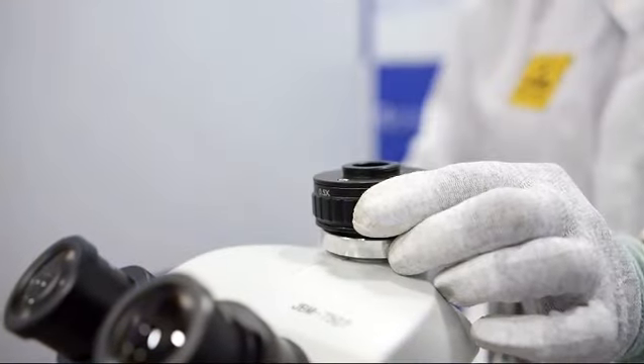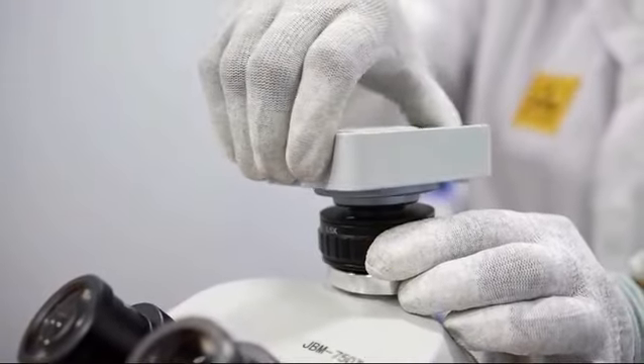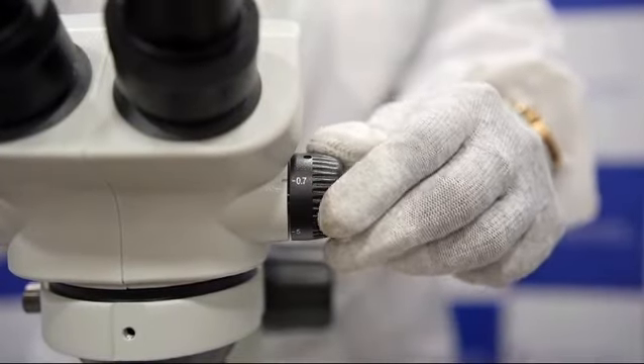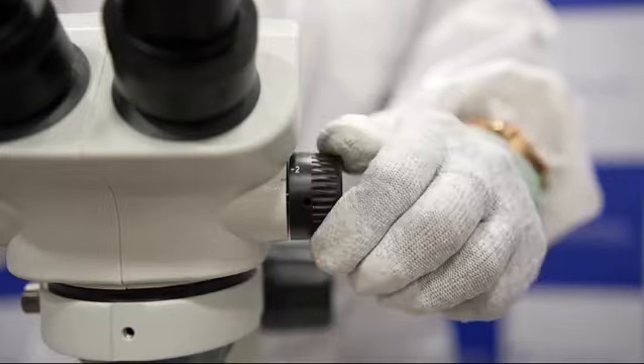This is the trinocular port. This is the C-mount adapter which helps to use the camera. This is the magnification knob which can be adjusted between 0.7 to 5x.